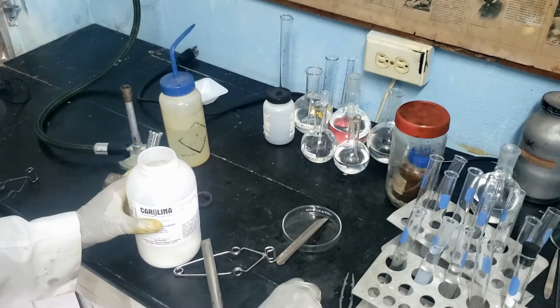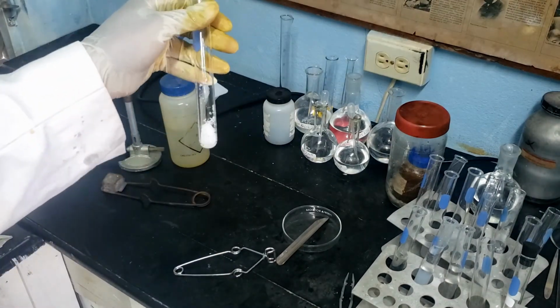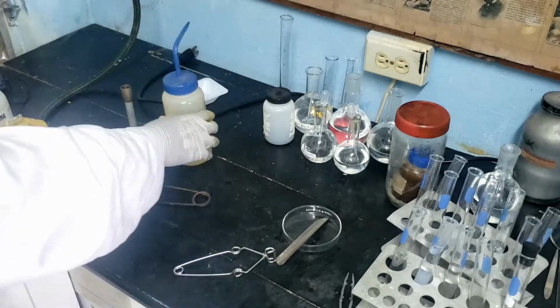In this experiment, the pH of hydrated aluminum chloride is tested using pH paper.